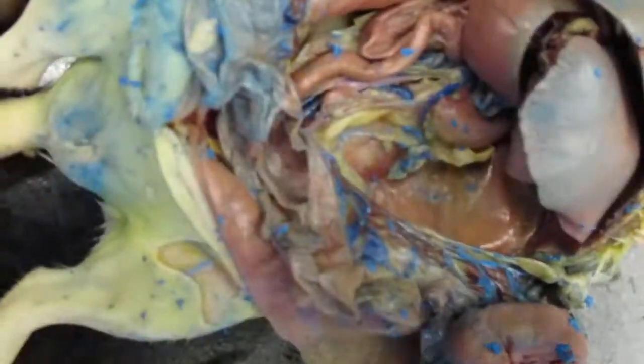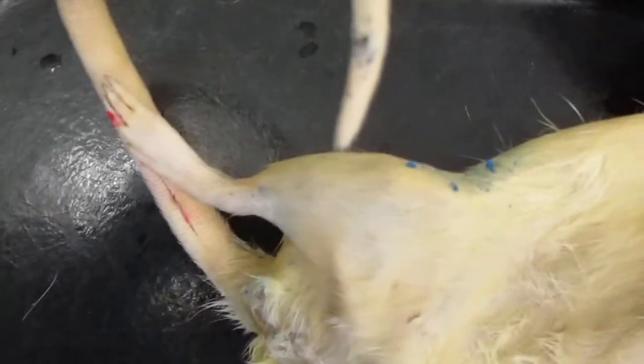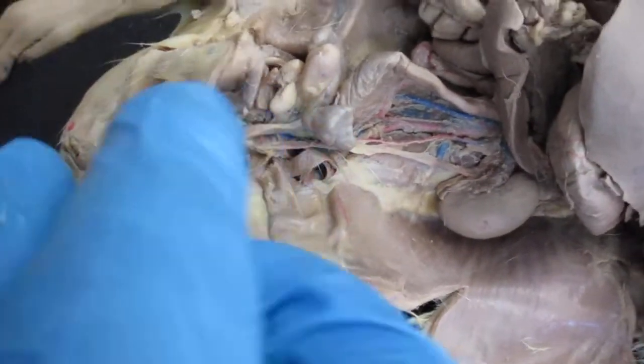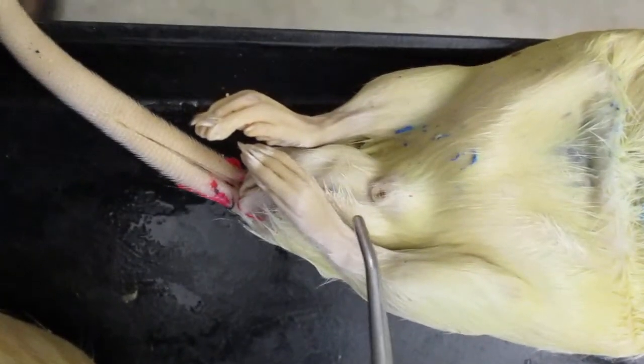Okay. Let me show you on the rat some things. I don't know if you can see this or not. I looked at the wrong one. This one. Let's just go over here. So, if you look at the rat, we can see the undissected rat right here.